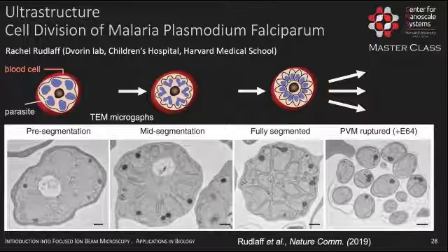The TEM images can give you a qualitative idea about that process. You can recognize certain organelles, for example, these bottle-like features, but then also you can see the different daughter cells, and inside of the daughter cells you see these ring-shaped objects.